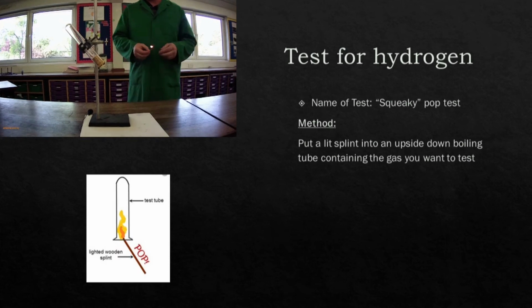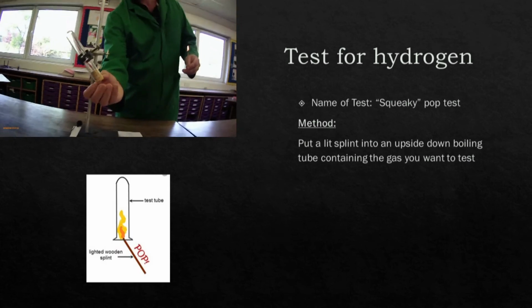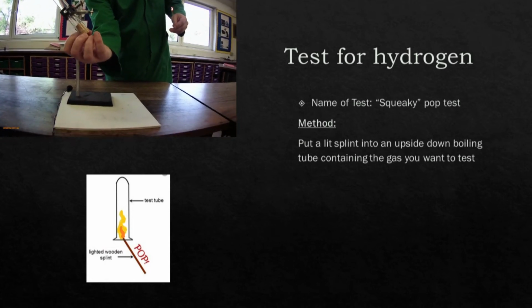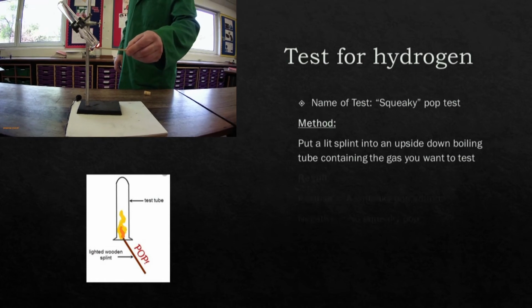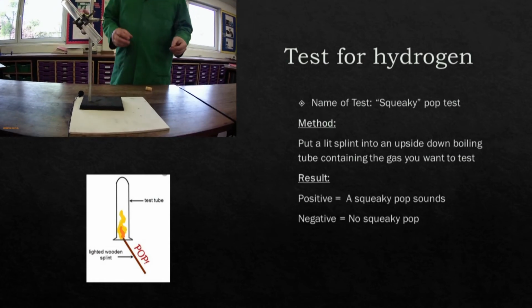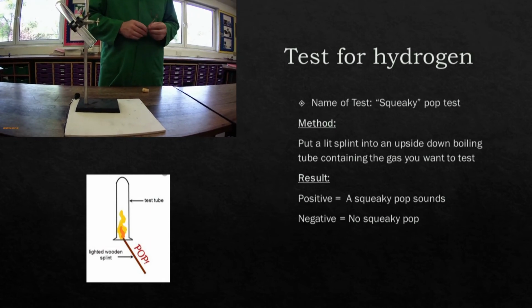So here's a flame, and I'm going to take the bung off the bottom here, like so. So off comes the bung. And I'm going to put the flame into it, and we get a very squeaky pop. That was almost a Mr. Kippax-esque scream.